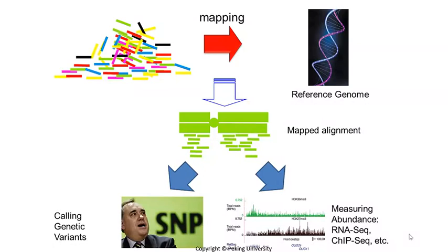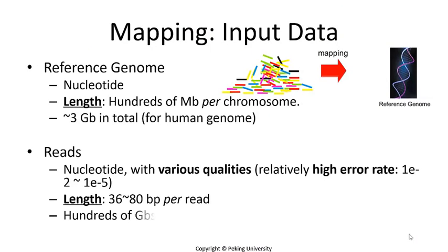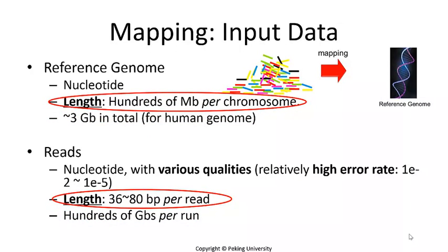Reads mapping is often the first step of deep sequencing data analysis. Its quality and speed will directly affect the following up analysis. Essentially, reads mapping is still a pairwise sequence alignment, but the feature of deep sequencing technology make it very different from the classical sequence alignment which we've introduced before. The first difference lies in the sequence length.